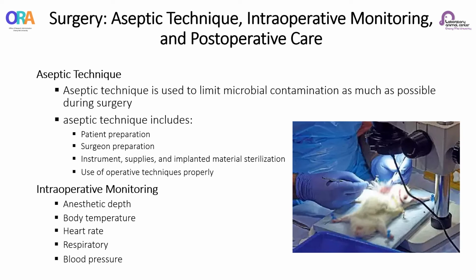For all species, aseptic techniques include patient preparation such as hair and feather removal, disinfection of surgical sites, surgeon preparation such as wearing appropriate surgical attire, sterilized gloves, something like that, instrument, supply, and implanted material sterilization, and use of operative technique to reduce the potential for infection.